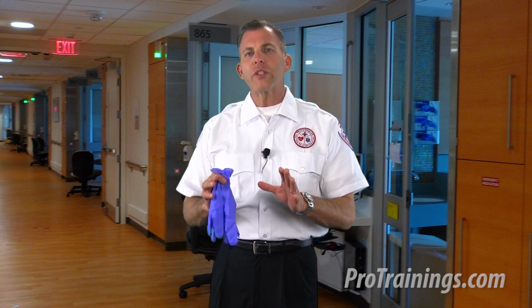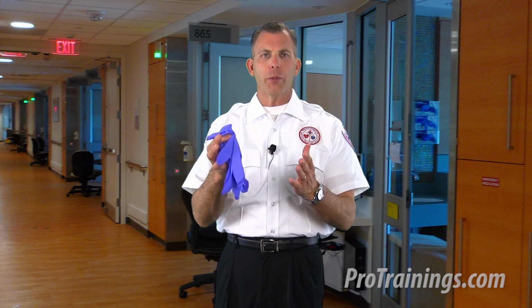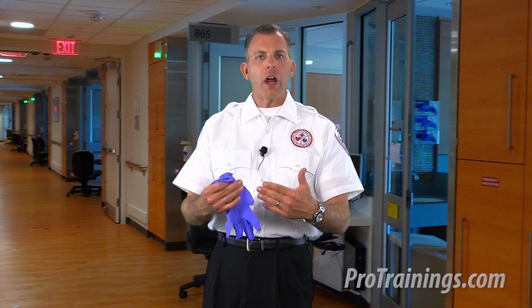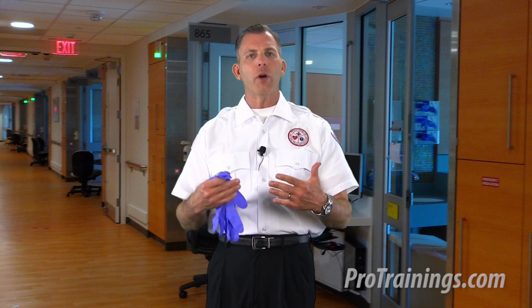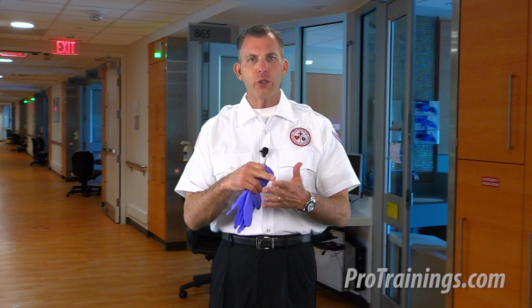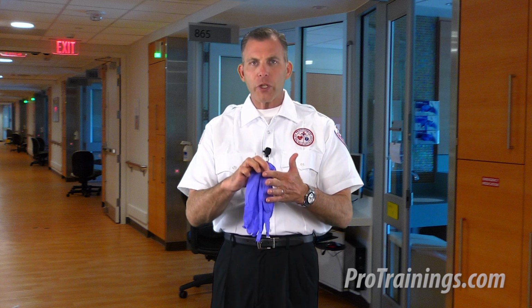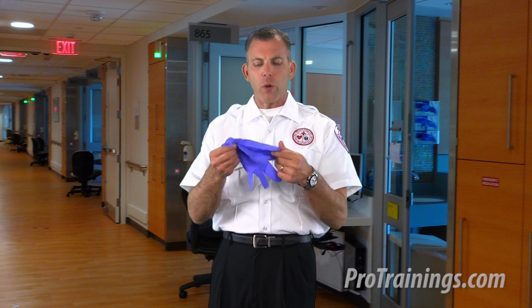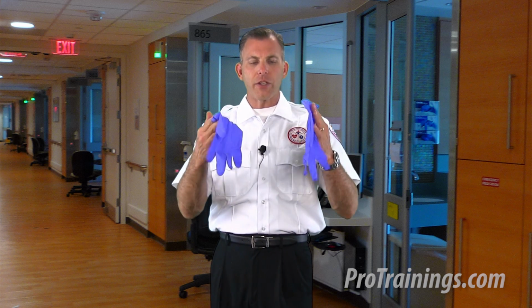Okay, so it's important to understand the proper donning and removal of the personal protective equipment, in this case, gloves. Our gloves are our next line of skin to help prevent any type of contamination into cuts, scrapes. You know, the hands are so easily abraded: hangnails, paper cuts, ways to actually get through that layer of skin. And that's why it's so important to have medical grade gloves. In this case, they're nitrile.